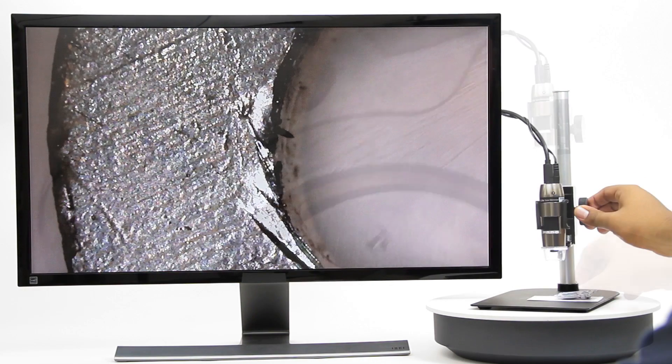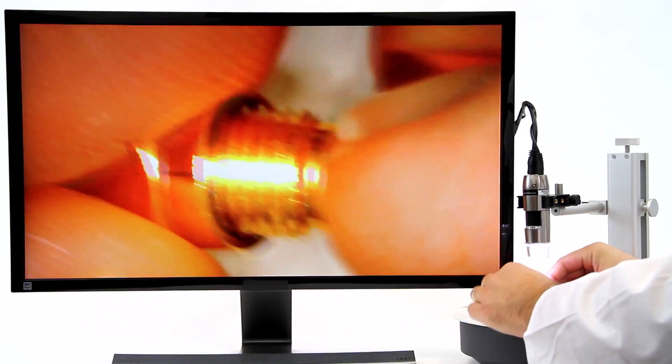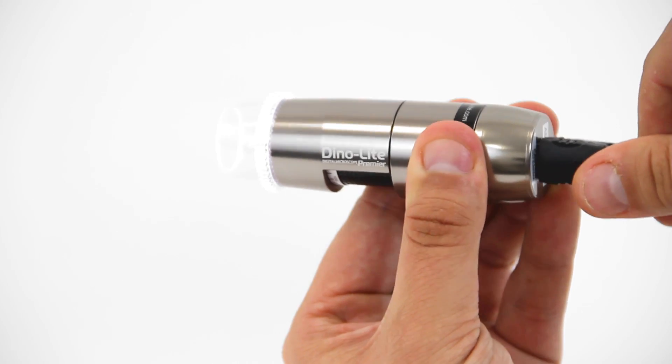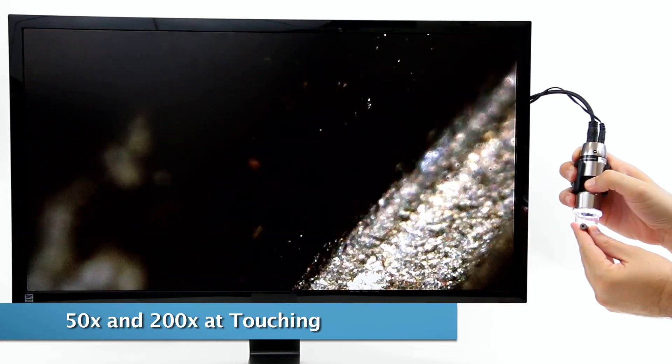These AM5018 models are HD interface models that connect directly to TVs or computer monitors that have HDMI ports. Simply connect the Dynolite to a screen using the included cable and included AC adapter, then select the HDMI output for the screen and the video is live.